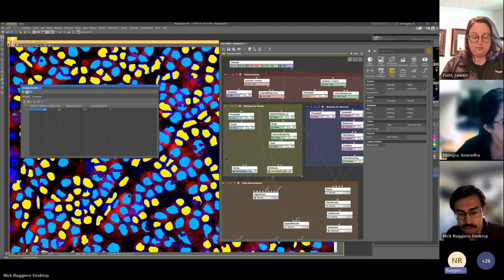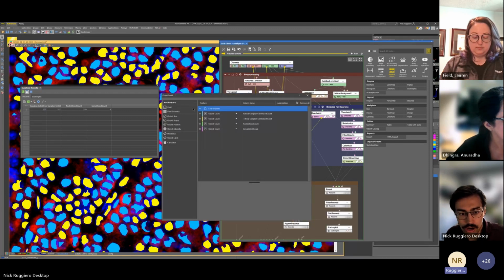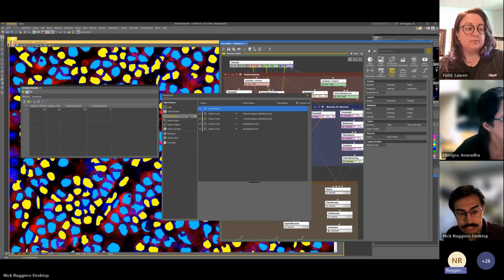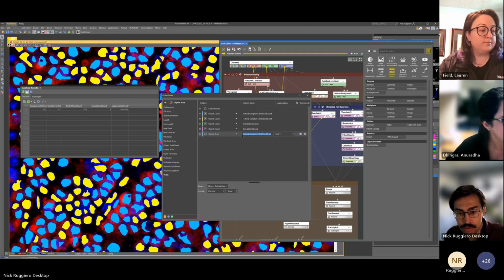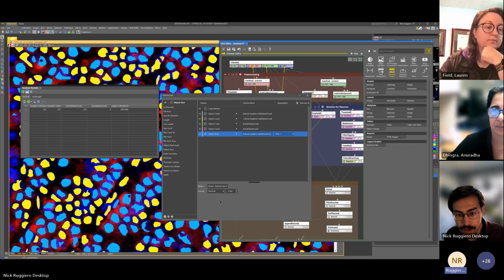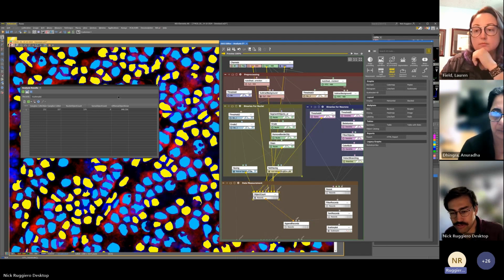And then I had to count the soma objects. If we wanted to get more information off of the soma objects, we could say, give me the size of our object area. We can have it do object area in the soma binary. And we can have it say, let's say like mean average area of our soma bodies. And that data will populate here. So we can get pretty creative with the sort of data that we want to measure from these.